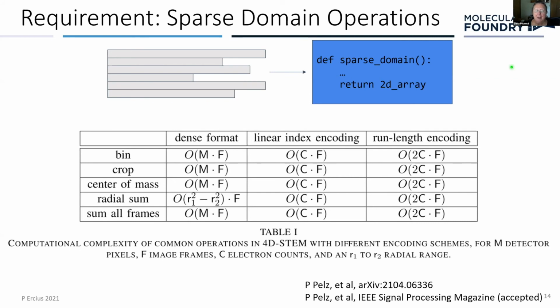Yep. Each of the instrument developers has their own custom solutions. So there's completely no interoperability between data and software. So it's silos that we're facing again. So we're going to go back.